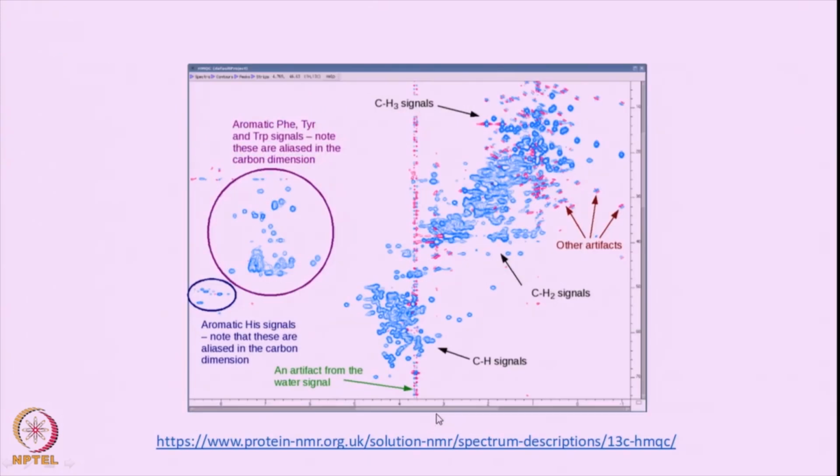So here is an experimental spectrum of a particular large molecule which is a protein. So here on this axis you have the proton, this axis you have the carbon here, and you can see a lot of crowding of the peaks, but all of the peaks are seen here. These are the CH3 signals here, in the protein. So these belong to the methyls, because the methyl protons appear at this chemical shift, and the carbons of the methyls appear at this chemical shift, and therefore these are the CH3 signals.